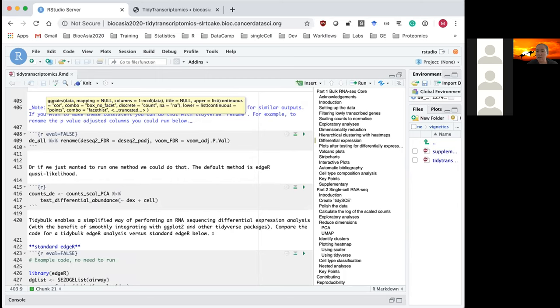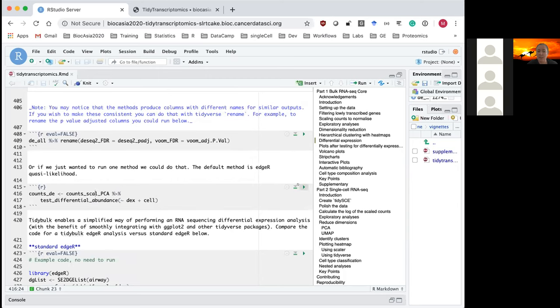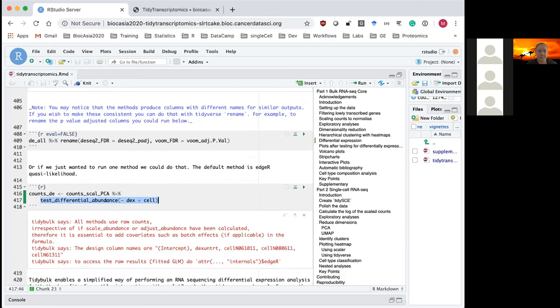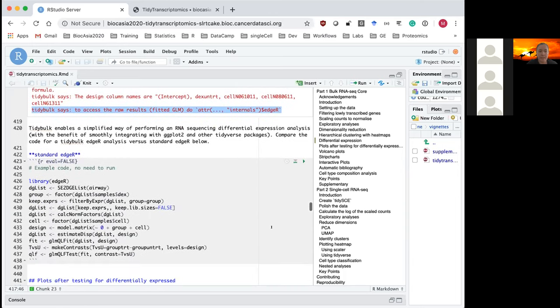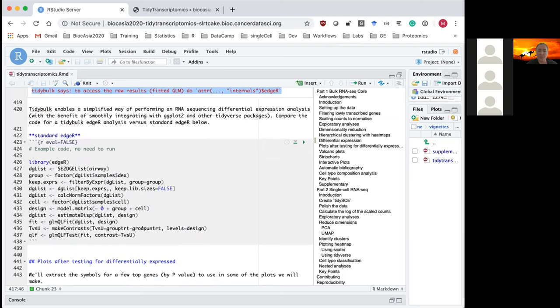You can also choose to run just one method — here using the default test_differential_abundance method, which is the edgeR quasi-likelihood method. For anyone who wants to dig into the raw results from edgeR, DESeq2, or limma, you can access those as well. For comparison, a traditional base R analysis using edgeR would require more temporary variables, more typing, and methods that can be harder to understand.